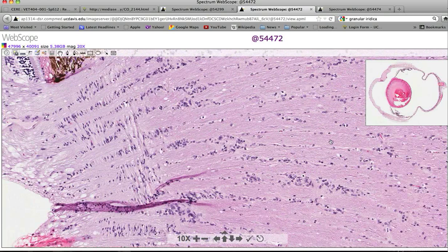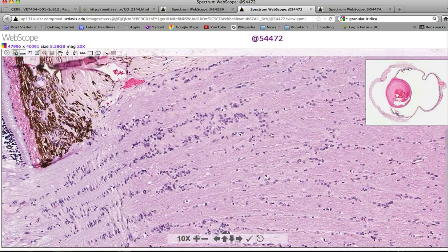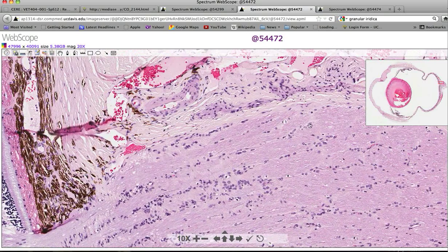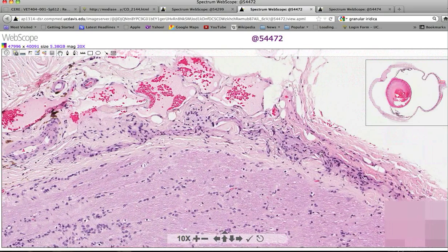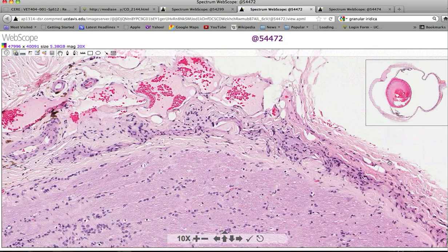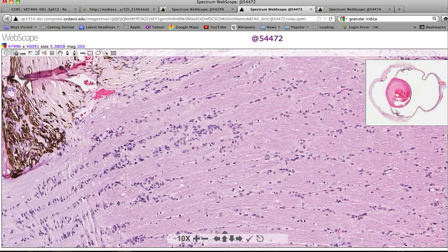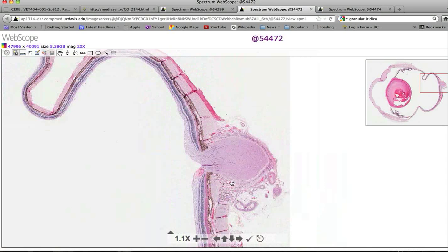Now we've got the optic nerve proper, which is identical to white matter of the CNS. Looking towards the edge, we can see the various layers of the meninges. We've got the delicate pia mater, which doesn't jump out here; the arachnoid, which is the more cellular layer; and moving towards the back, we can see the tail end of the dura mater, which would progress up through the orbit and back into the cranium, meeting up at the optic chiasm where the crossover happens.